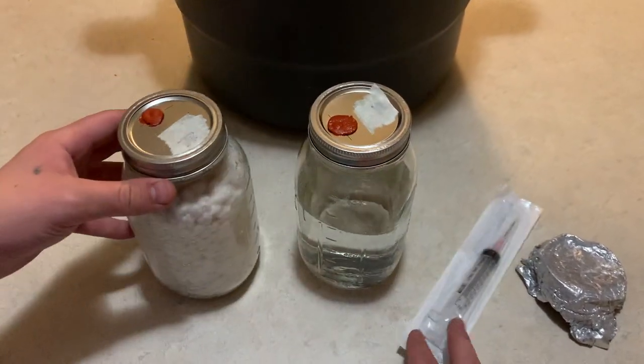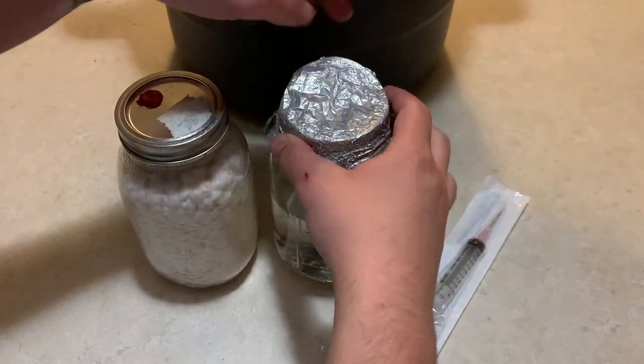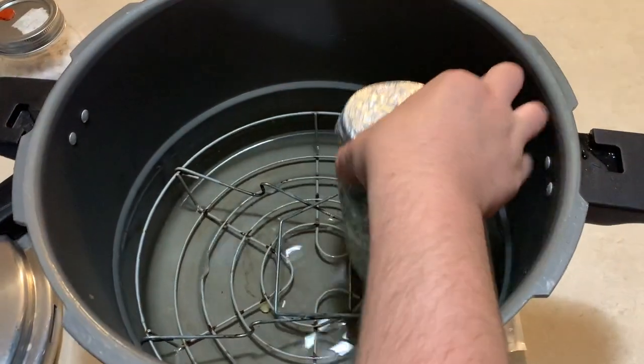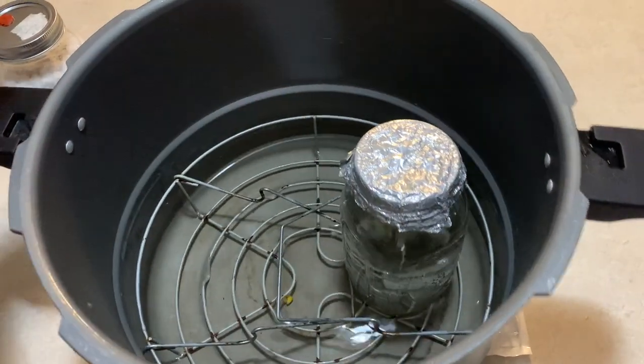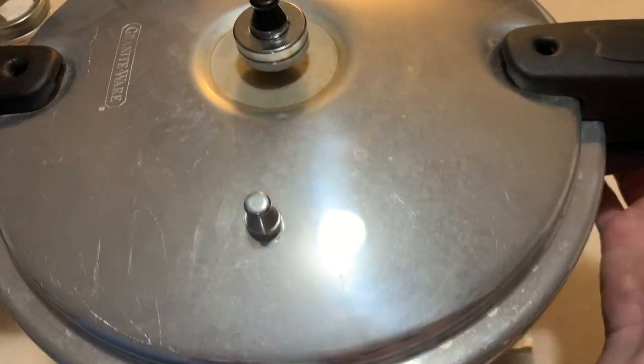You are going to need a jar of sterile water and a sterile syringe. The first thing you need to do is sterilize some water in a jar with a self-healing injection port. Sterilize for 30 minutes at 15 psi.